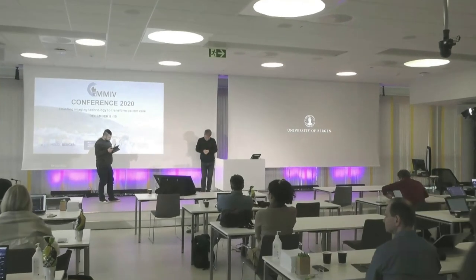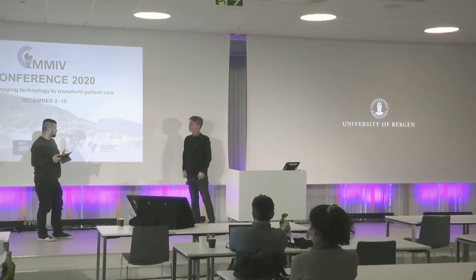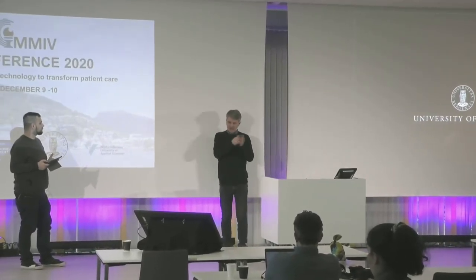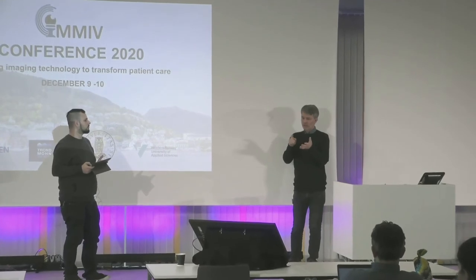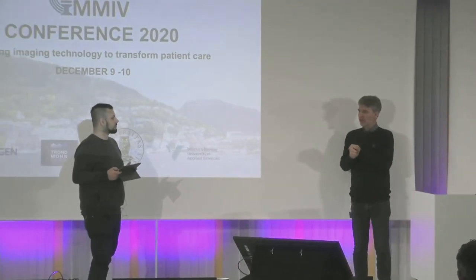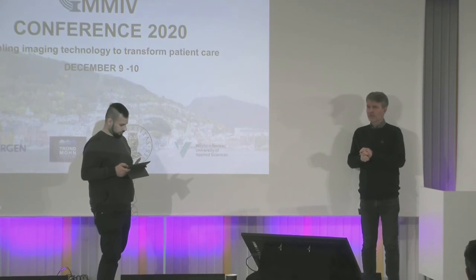We have another few questions. Heidi asks, how long does it typically take to run one sample? Well, like I just previously mentioned, it works with 200 hertz, so you can ablate 1 micrometer square at a time. A millimeter square would take 1.5 hours approximately, and you can calculate from there.